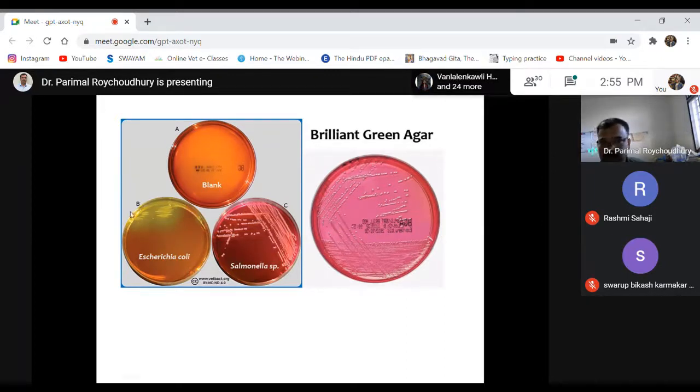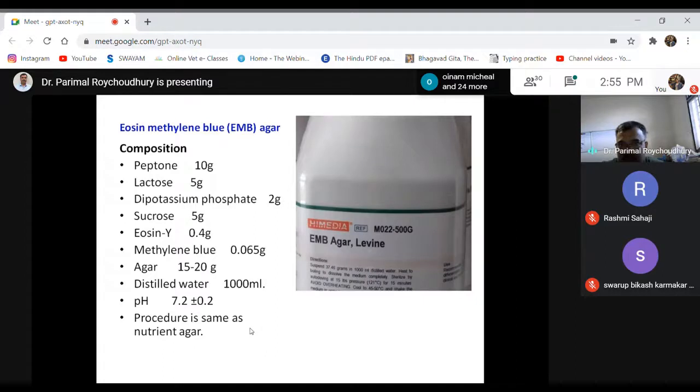Okay, if it is greenish discoloration, then obviously we can say it doesn't have any salmonella organism, because this is an acidic reaction. So thereby this kind of media we can call a differential media, as well as a selective media for isolation of bacteria.